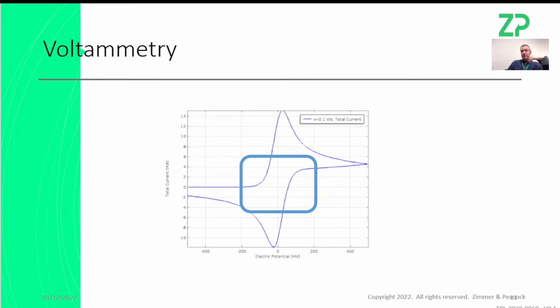I've personally never done it. At ZP, we've never done it. But when you first asked the question, could we look at these electrodes using voltammetry, it made me realize you possibly could. It's just people typically don't. But just because people typically don't, it doesn't mean you shouldn't try it. Something that just occurred to me as well: not only do I think you can do it by voltammetry, I think you can also do it by impedance spectroscopy.